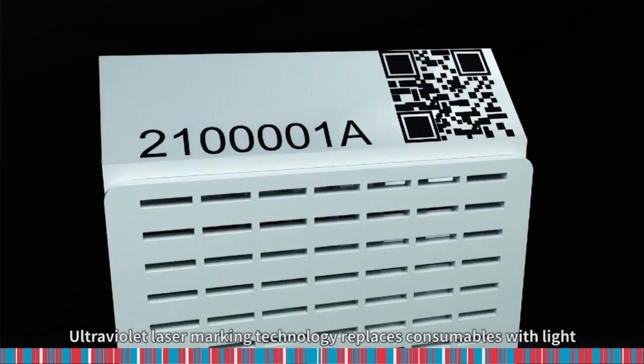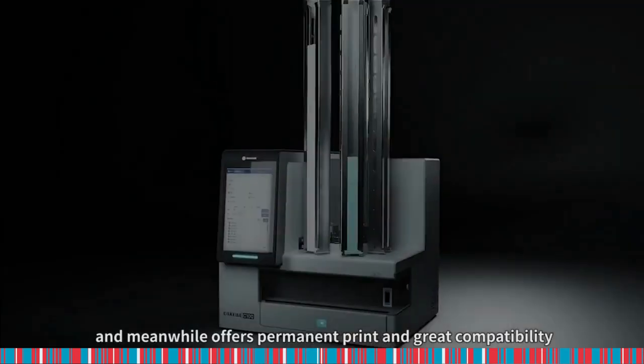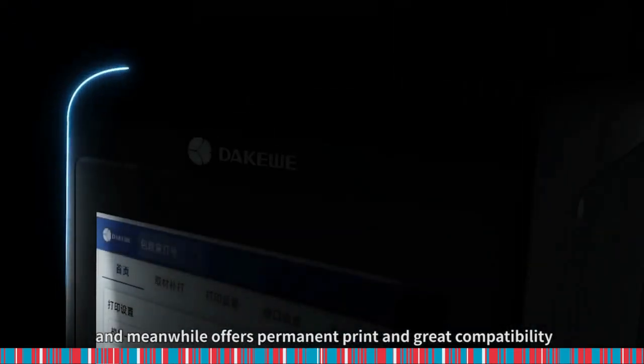Ultraviolet laser marking technology replaces consumables with light, and meanwhile offers permanent print and great compatibility.